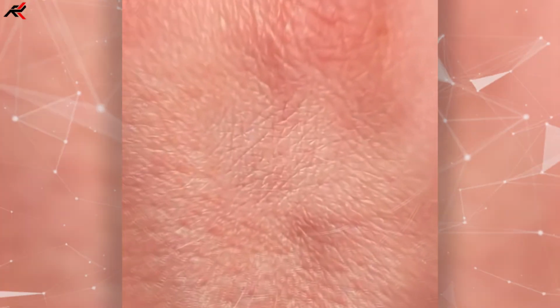When we look at our skin under a microscope, we see many patterns on our hands that we cannot see with our naked eyes. And if we zoom in more on our skin, then you can see the sweat flowing, which is flowing like this.